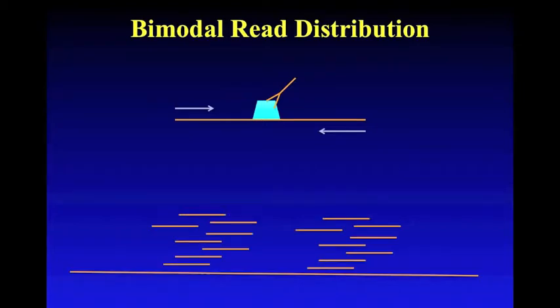This generates millions of sequencing reads, but then how do we identify the bound sites? The first issue is the type of reads that we'll get. So the DNA is randomly sheared into fragments. On average, the transcription factor will be bound towards the middle of the fragment, but the DNA sequencing reactions will happen from either end of the DNA fragment. So you'll end up with a bimodal distribution of reads.